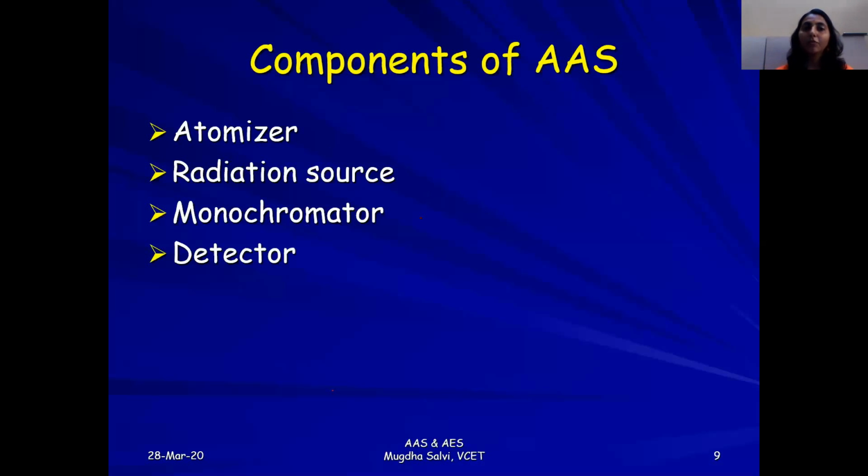Monochromator, for specifically separating out your wavelengths, because this time you have a flame, and the flame itself is going to have a very strong bandwidth. And to avoid all these radiations, you need a good monochromator which will be able to separate both your absorption spectrum and the flame spectrum. So you have to have a very good monochromator system. And lastly, the detector.